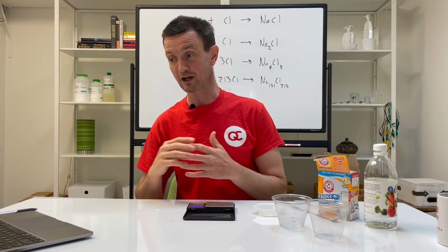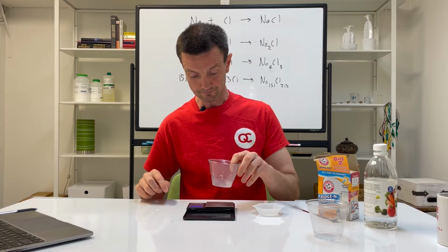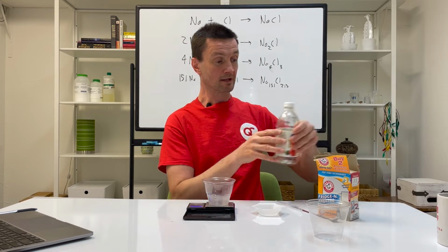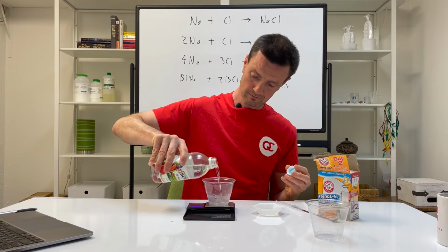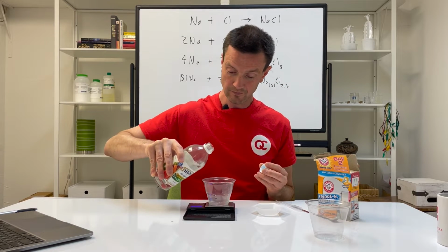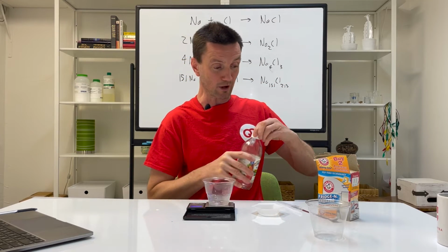Measure out the vinegar, place a cup on a mass scale and zero the scale. So I'm going to turn my mass balance on, place the cup on the mass balance, tare it, so it should say 0 grams. Now I want to put in 28 grams of vinegar, and this does not have to be exact, we're just getting a sense of what happens if you put in excess vinegar. So that's 28.8 grams, that's fine.